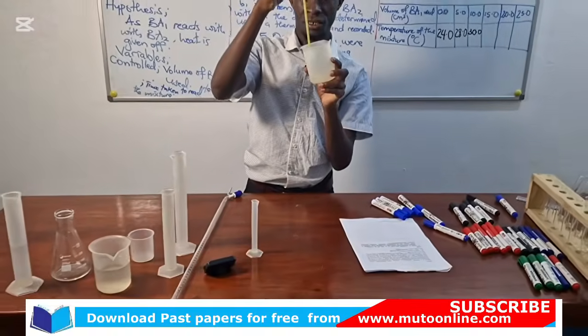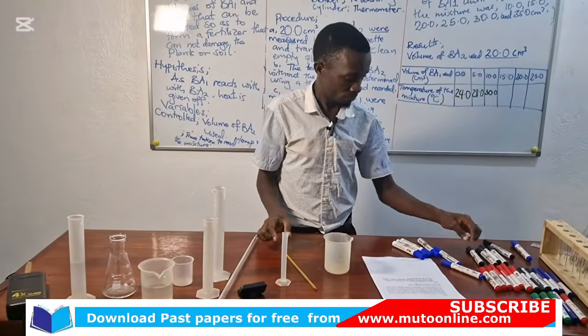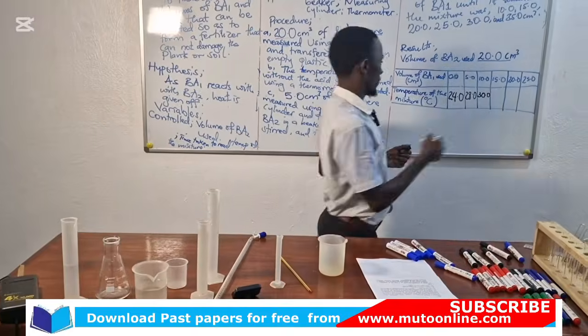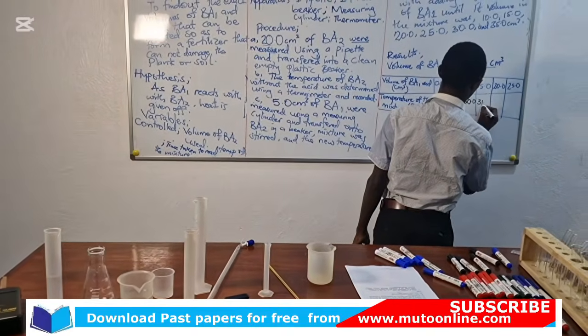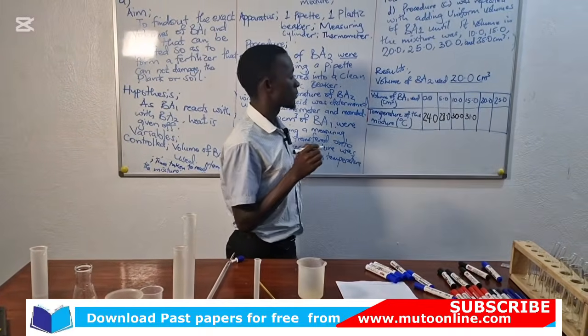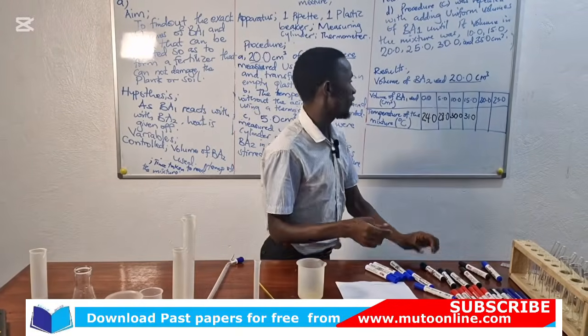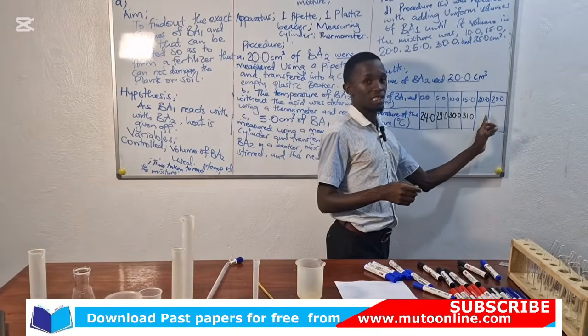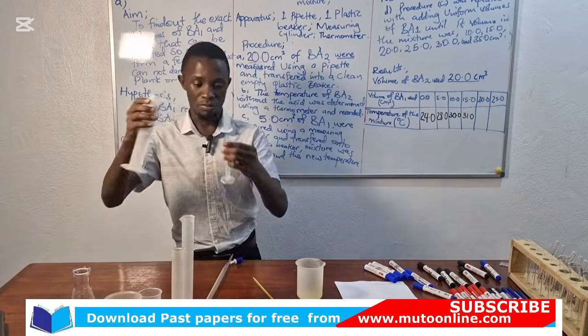Or 30.5. I think you've noticed it. 31 or 30.5. So I'm going to add more 5 again to make it 20 this time. We are going to measure more 5.